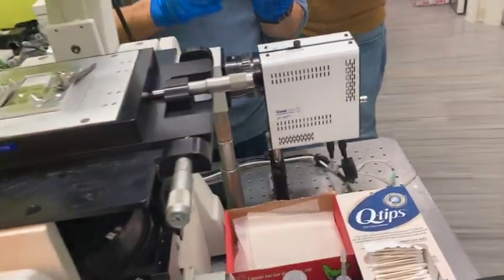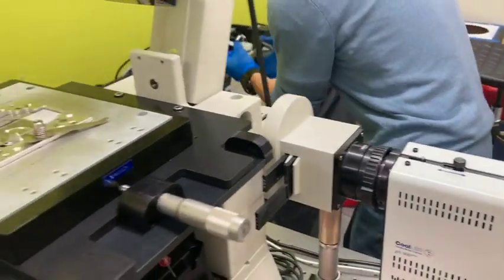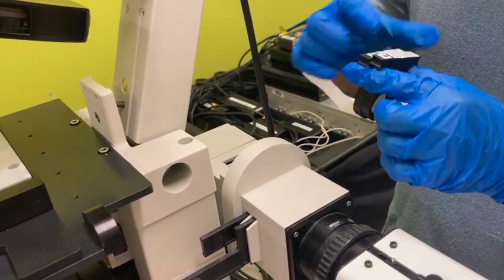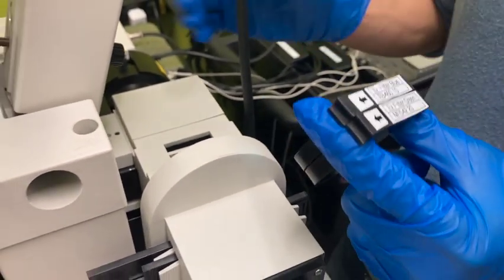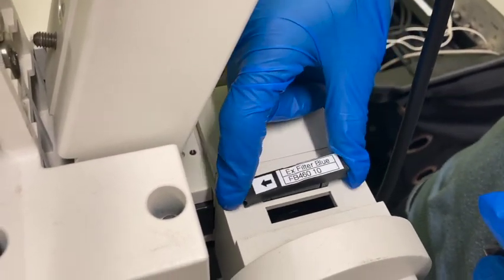Last but not least, we have this filter. Now we go back to the filter. We have two different filters by now because mostly we use blue for microtubule and green for our gold. And it goes into these two slots.